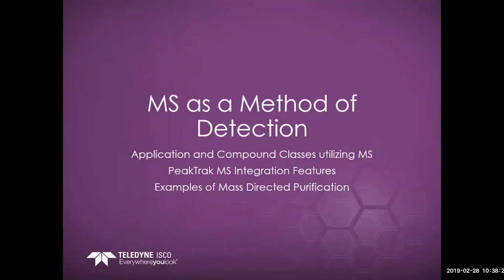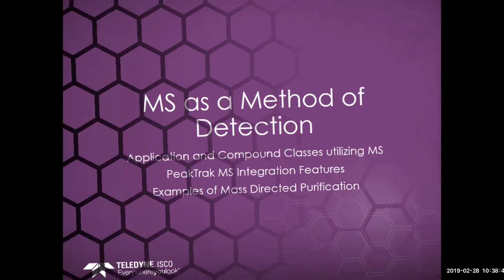So the last section I'd like to talk about today is the mass spec detector as a method of detection. We'll be talking about this in 3 different areas: application, compound classes utilizing mass spec, PeakTrak mass spec integration features, and then examples of mass-directed purification.